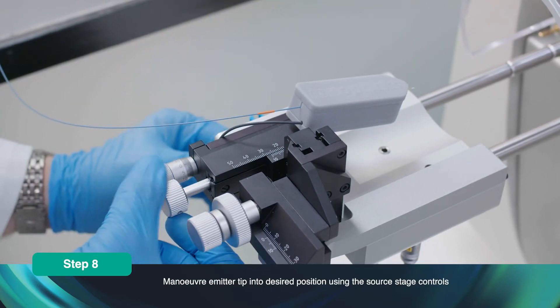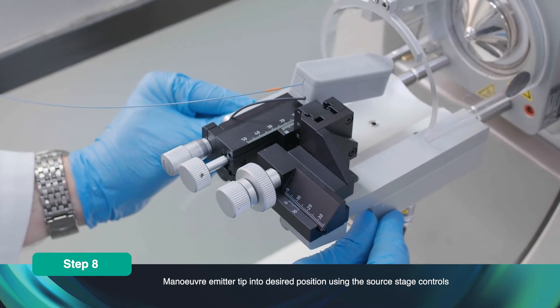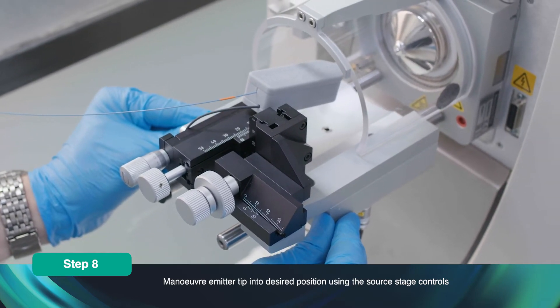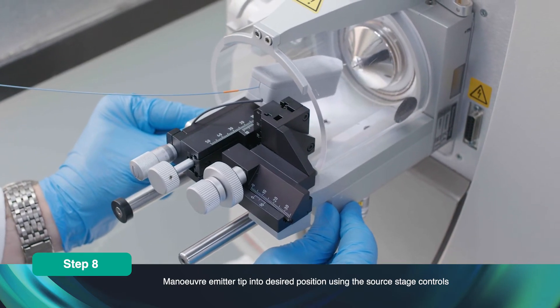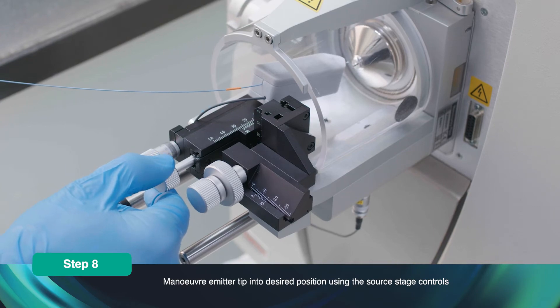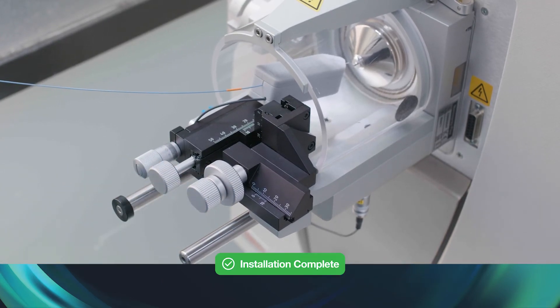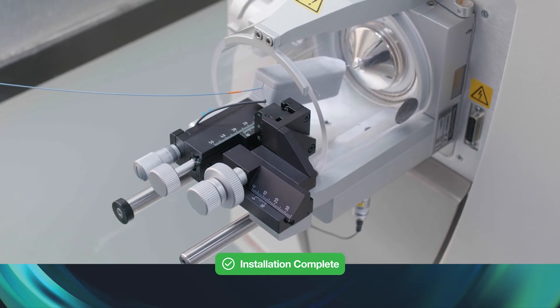Maneuver the emitter tip into the desired position using the source stage controls. The emitter should be 3 to 5 mm from the ion transfer capillary. The column is now installed in the housing and ready for operation.